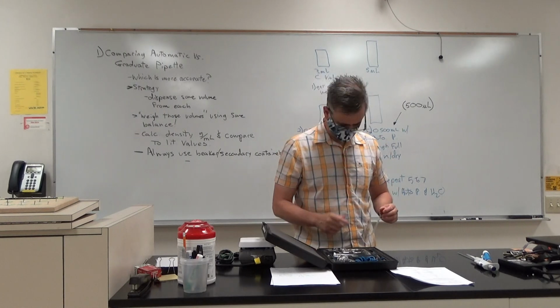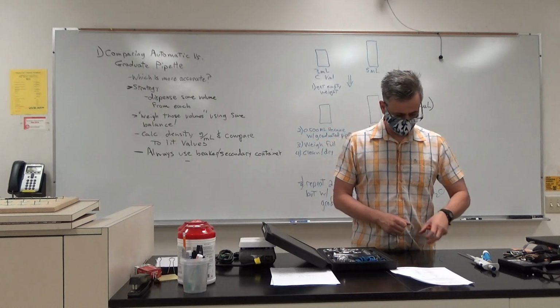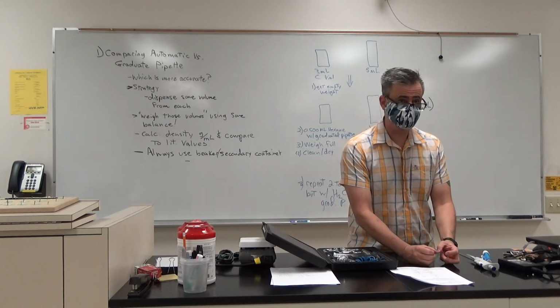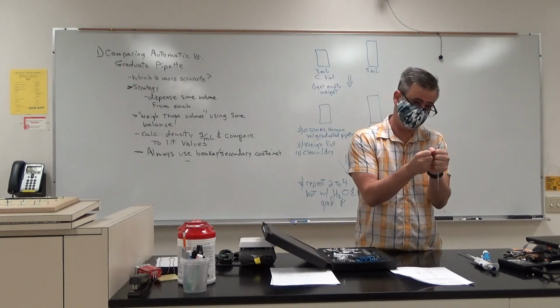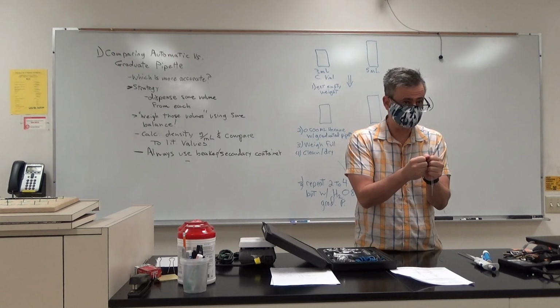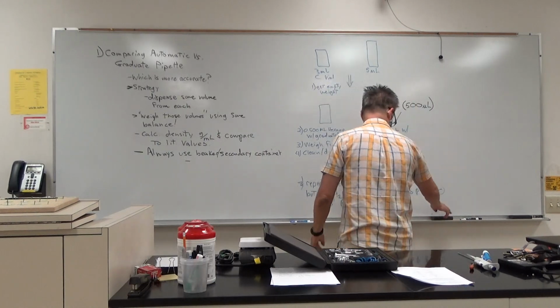One thing I also forgot to mention is, whenever you're dispensing liquid, here's your supply liquid, and here's where I want to dispense it. Always have those close to each other. Don't travel across the world to dispense, dribbling as you go, okay? Always put those things right next to each other. It's better technique, okay? Make sense? Any questions about pipettes? All right, that's it for pipettes.